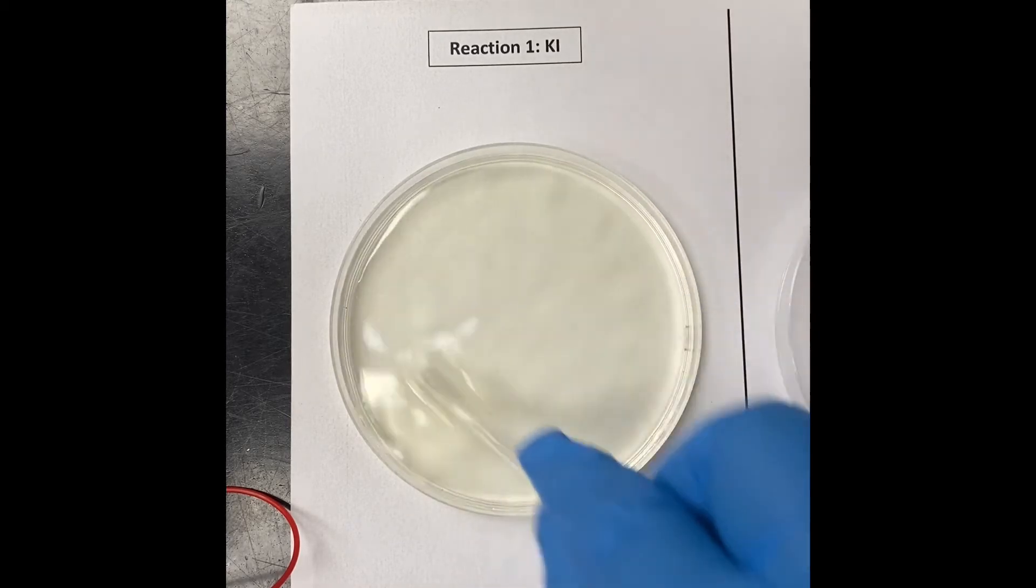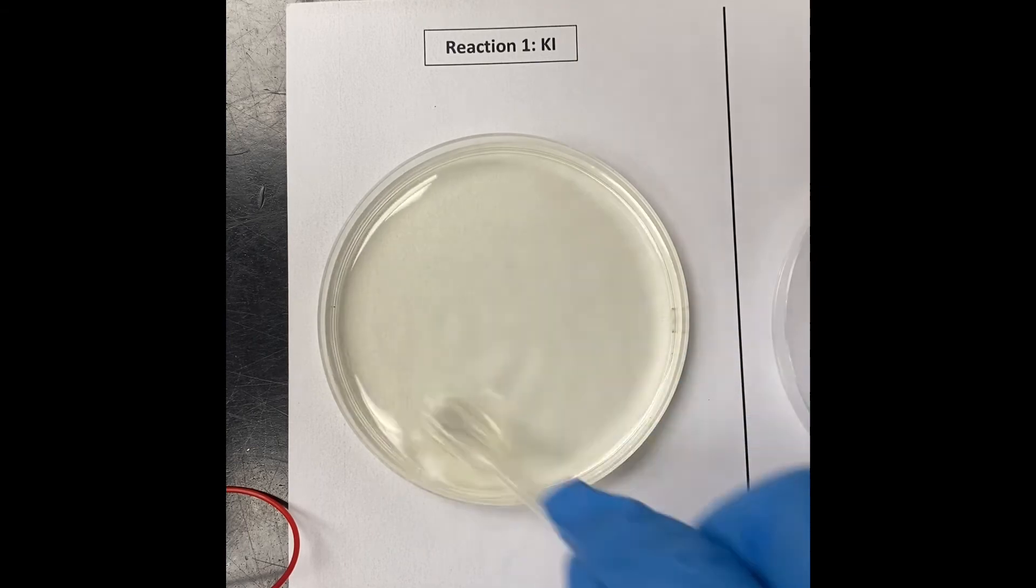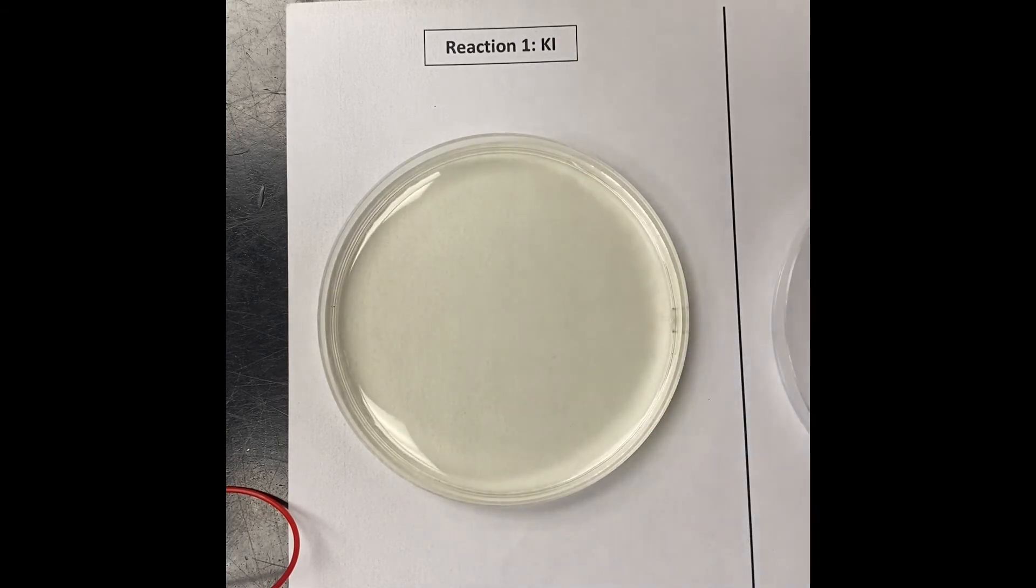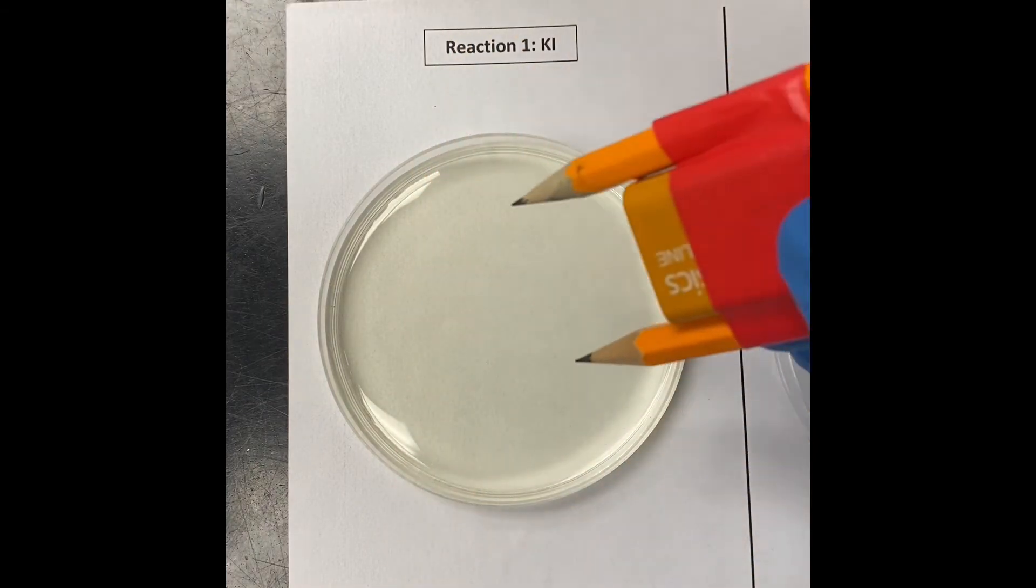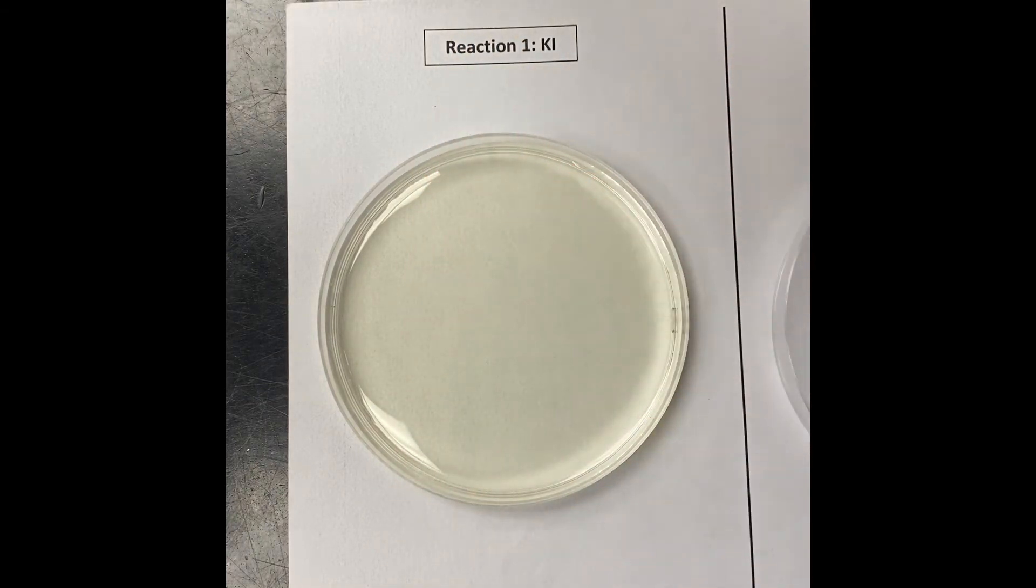So I'm just going to do a little bit of a stir here. I have potassium iodide with phenolphthalein indicator in here. So I'm going to take my electrolytic cell, or my battery, or my power cells, and I'm going to attach that. I'm going to dip that in the solution.